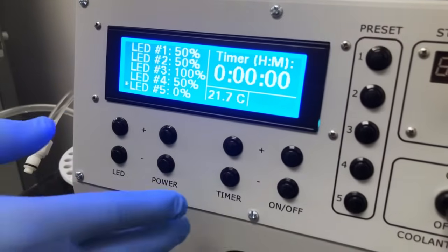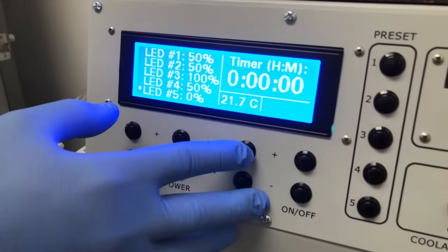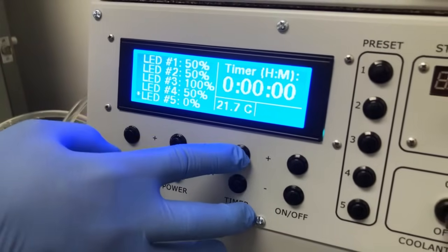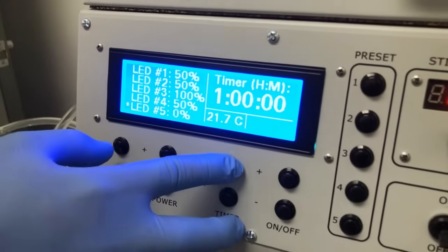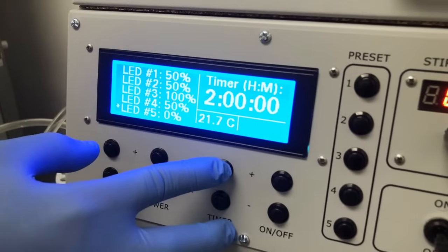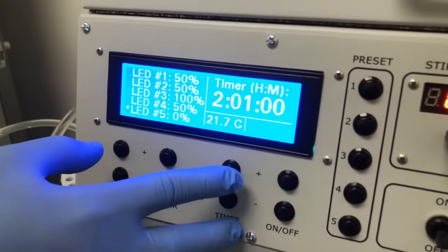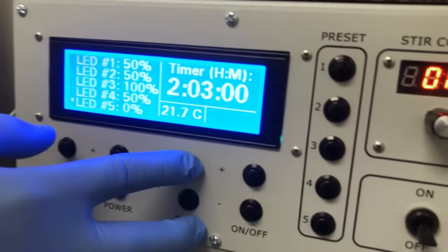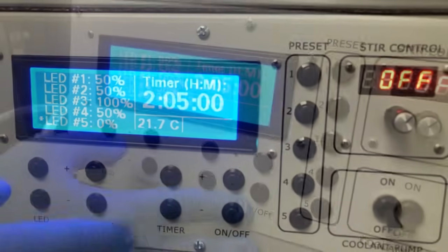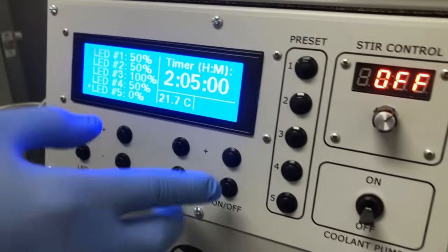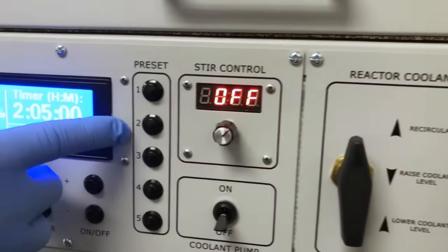As we move left to right across the Lucent360's operation panel, you can set specific reaction times and pause the reaction counter when necessary. Under the timer is the temperature gauge to indicate the temperature inside the reaction chamber. There are five available presets for the modules which you can program to your needs.